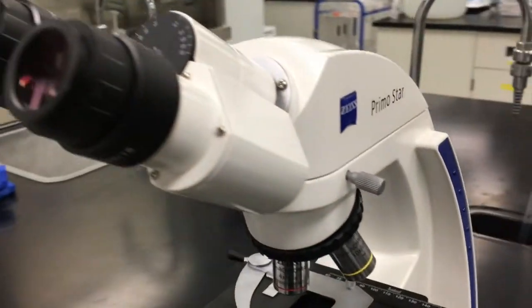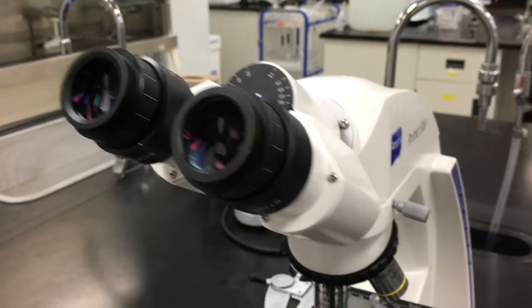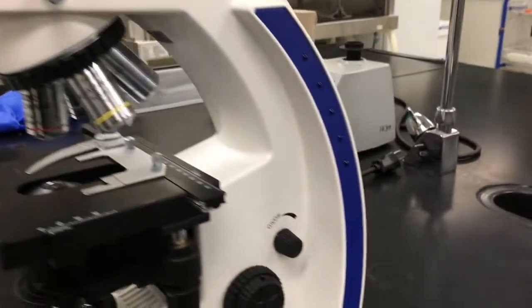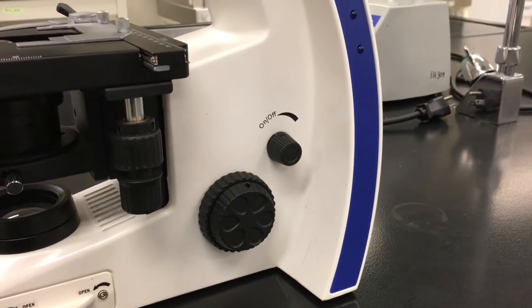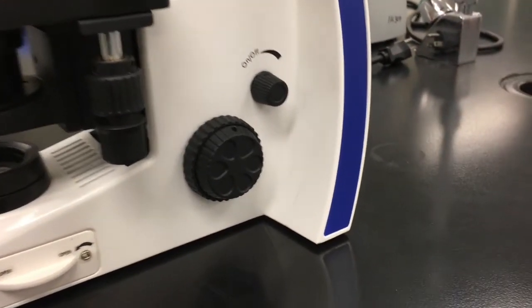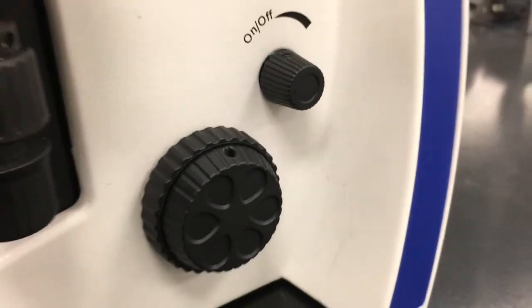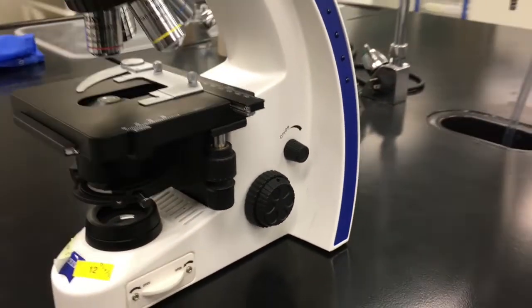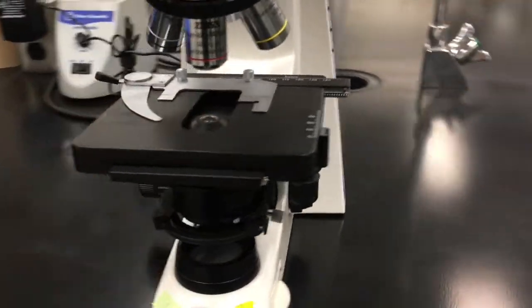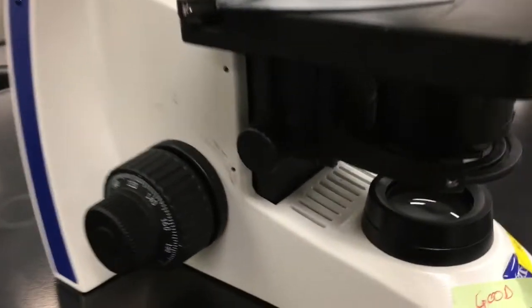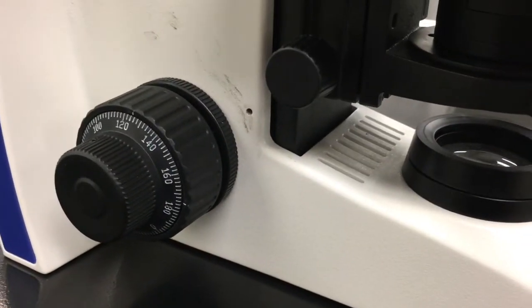In order to bring specimens into focus, you need to locate the coarse adjustment and fine adjustment knobs on your microscope, which are seen here. The innermost knob is the coarse adjustment knob, the outermost is the fine adjustment knob. More difficult to see on this side, but if you look to the other side of your microscope, this becomes more apparent. So the larger part is the coarse adjustment, the outermost part is the fine adjustment.